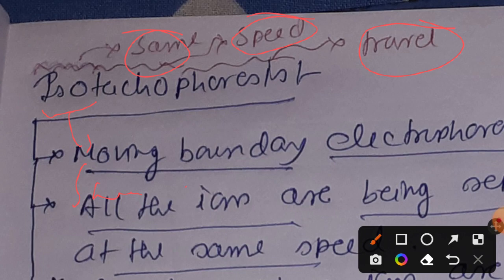That means isotachophoresis, by its name, tells us that it provides separation at the same speed, right?